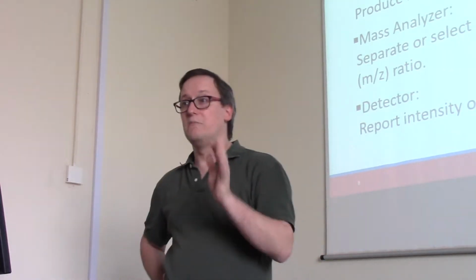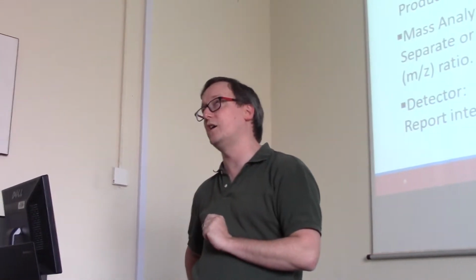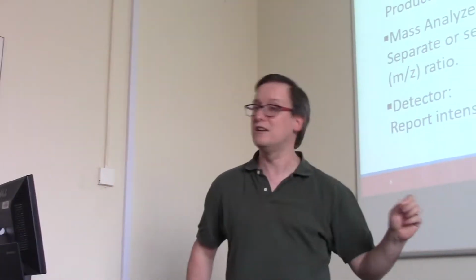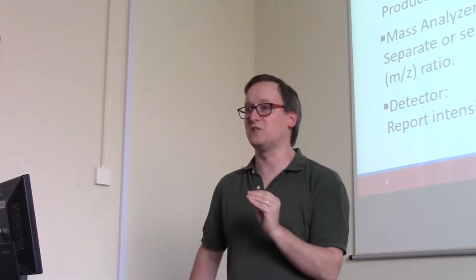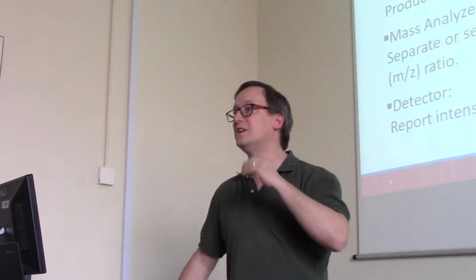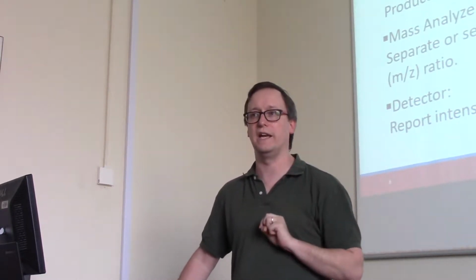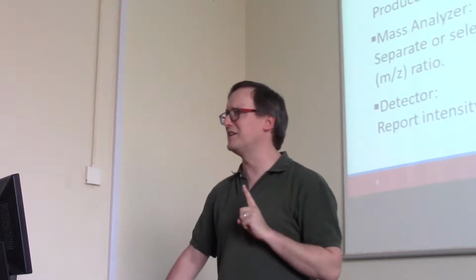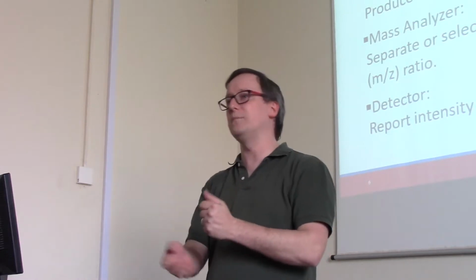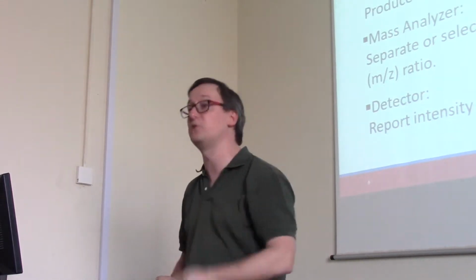So let's start by saying mass spectrometers can only measure things that are ions. When I use the word ions, it means I'm talking about something that we can measure. If something is not an ion, we can't measure it. Therefore, there's a lot of emphasis on these methods that lead to our ability to measure in a mass spectrometer different biological compounds. Two of the most significant of these are called MALDI and ESI. MALDI stands for matrix-assisted laser desorption ionization. It means that we're firing a laser at a sample that's been buried in matrix, we get a big plume of ions, and from those we can start our analysis. So it's kind of a pulse technique.